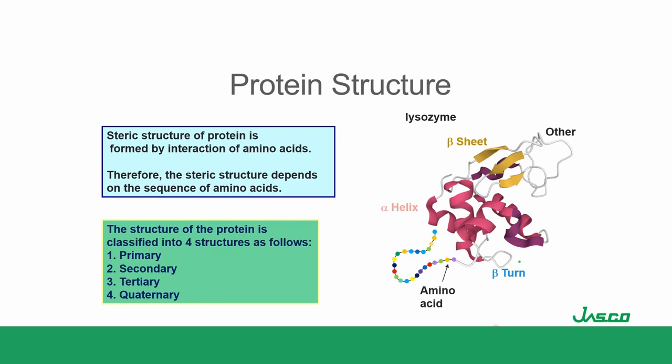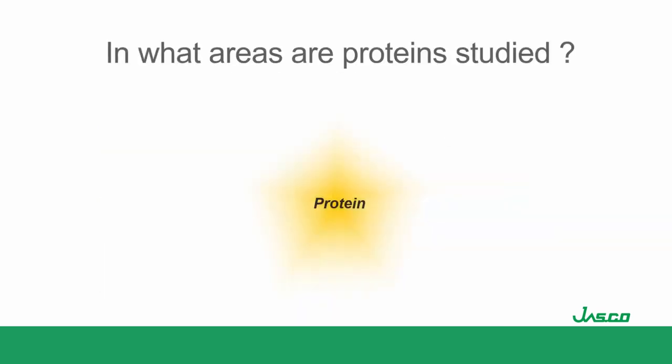So what are the different areas to study proteins? First, we have the pharmaceutical field, with the development of new medicines.